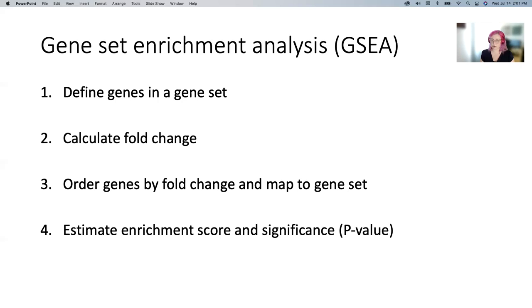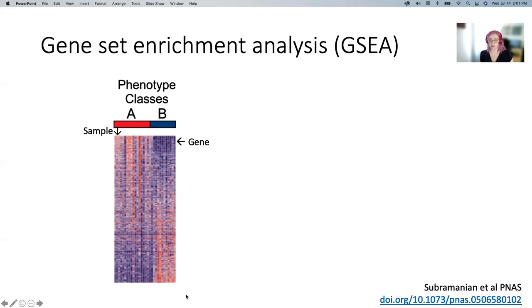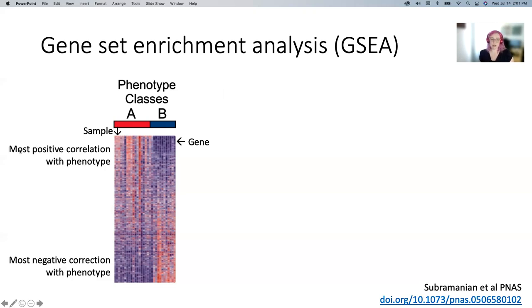Another way to think about GSEA: it's just asking if genes in a set generally go up or down in expression between your two biological states, grouping those genes by the predetermined gene sets. How we run this: define genes in a gene set — already done, using Broad. Then calculate fold change, importantly of all genes in your dataset. You don't define significant genes versus not — you just calculate fold change across everything. You order them and map how many of those genes are in the gene set, then estimate this enrichment score and significance. There's a really nice paper that goes through the nitty gritty, referenced in the notes.